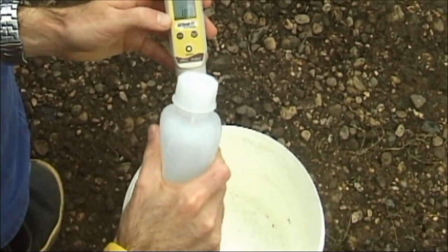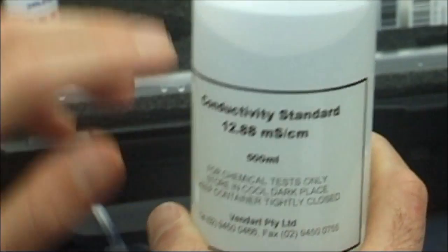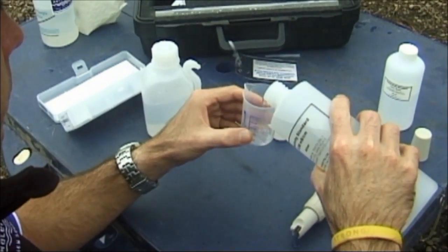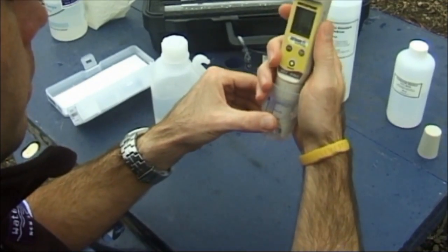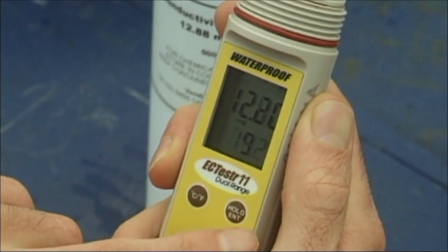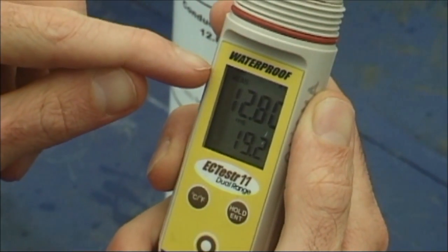Rinse the probe. Using a different container, repeat the process with the 12.88 millisiemens calibration solution. When the measurement has stabilised, press hold. CO will appear again. The meter will go into measurement mode automatically.